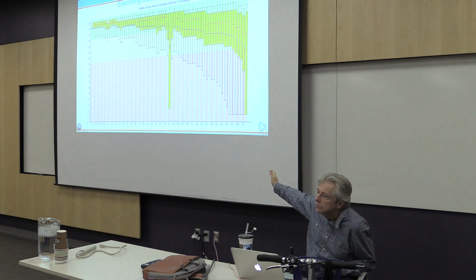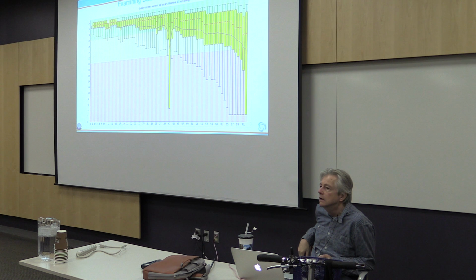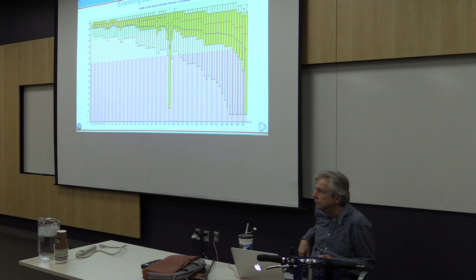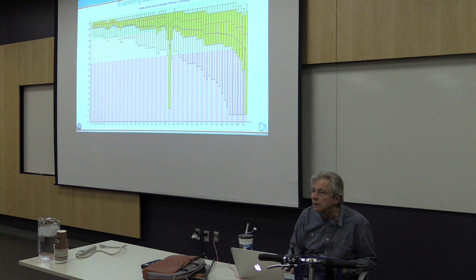One of the things you can also do with your reads is just look at them. If they're in the data store, you can click on any file, and it will open up and you can read what's in that file. Sometimes you may have no idea what you're looking at, but other times, I'll give you an example at some point here, you'll actually see the sequences. If you get used to looking at your data, you'll start to understand whether things are going right or wrong.